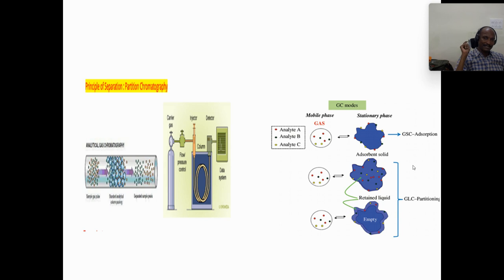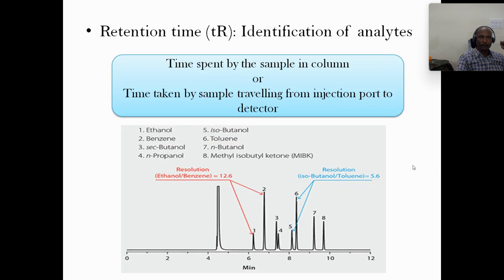The stationary phase is liquid, and the principle is partition. One more important thing in gas chromatography is retention time. Here, retention time is majorly useful for identification of the analytes. And one more important point in this case is, what is the retention time?